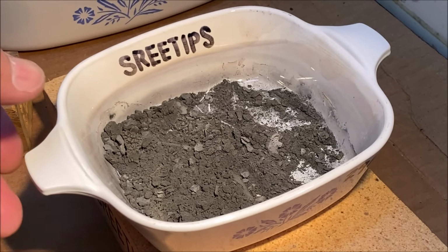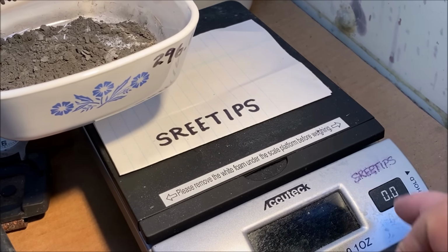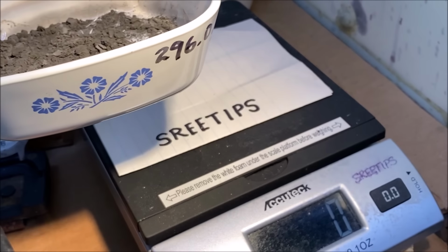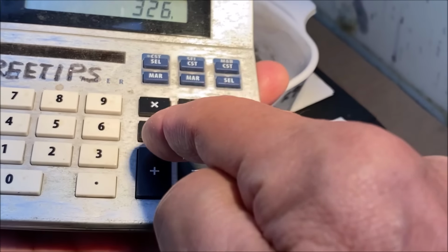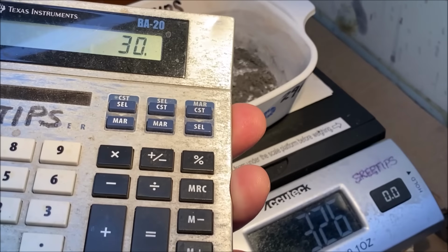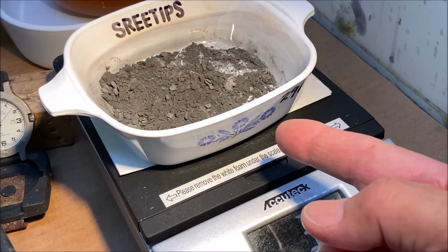Here's our impure platinum sponge. I've allowed it to cool off. Let's see if we can get a weight on this. I've got the weight of the dish on here, 296.0. Call it 326. So we've got 326 minus 296 equals exactly 30 grams of impure platinum in here.